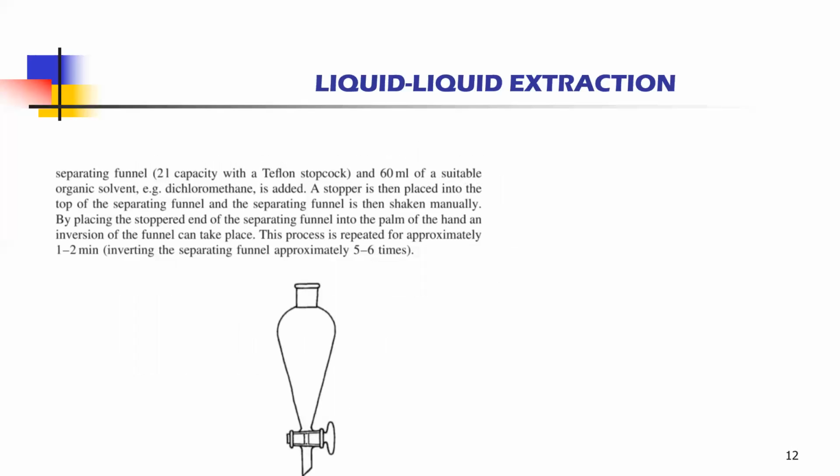For the separating funnel, we are going to have a Teflon stopcock, and 60 ml of a suitable organic solvent we are going to mix.